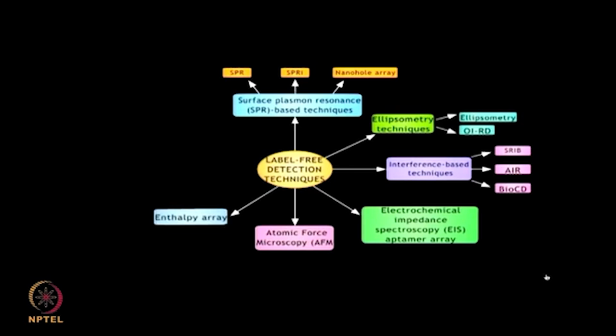Enthalpy array: thermodynamics and kinetics of molecular interactions are measured in small sample volumes without any need for immobilization or labeling of reactants.